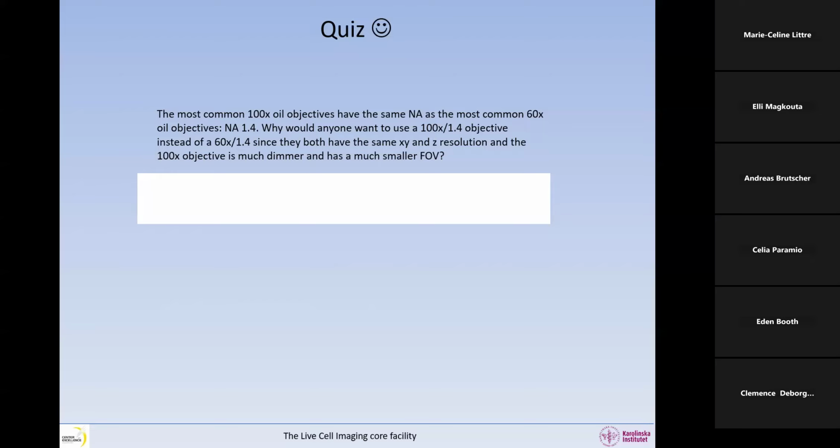Yes, absolutely. Good. So you said the camera pixels, I think you meant image pixels. We cannot change the camera pixels, right? They are where they are. We can't do anything. But by adding some extra magnification here, even though we're adding magnification, we're making our image pixels smaller.